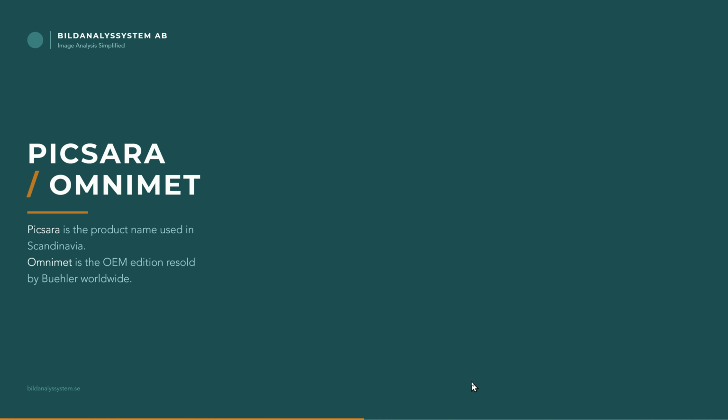So before I start with the actual introduction, let me just explain the name Picsara and Omnimet. So what is Picsara Omnimet? Well, it's actually the same software with just two different names. Picsara is the name we use in the Scandinavian countries, and Omnimet is the name we use in the rest of the world. So we are very proud to work with resellers, and in the Scandinavian countries we work with Micron, and in the rest of the world we work with Buehler, and we're a very proud partner and happy to work with these two resellers.